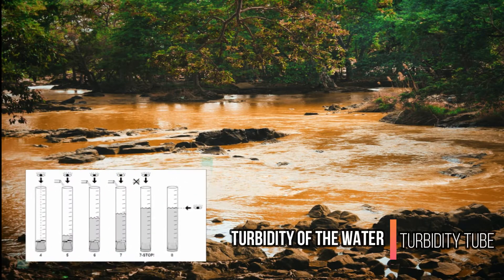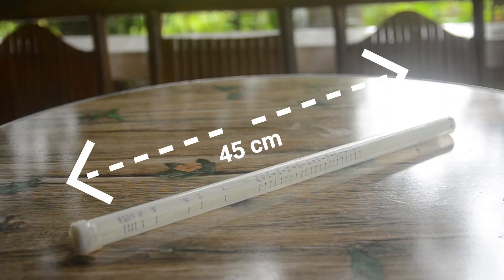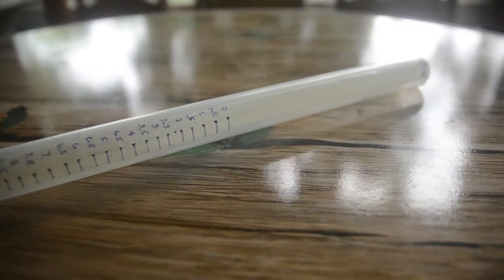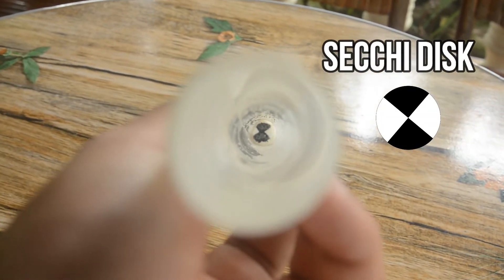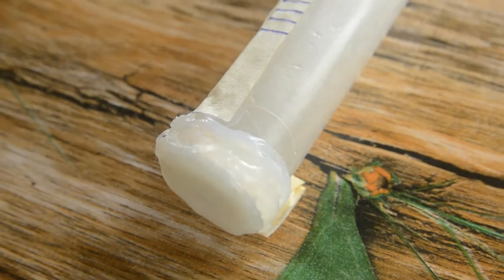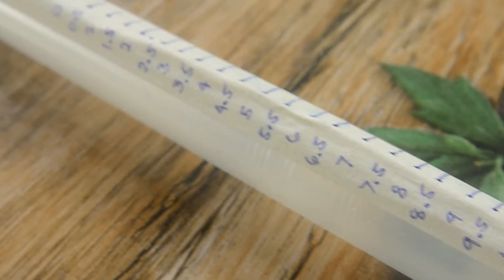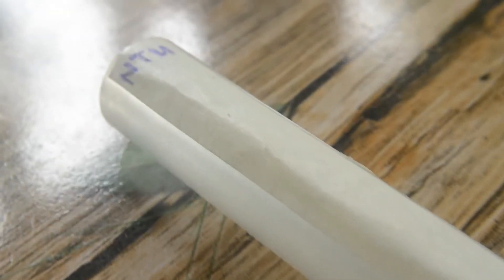This is a tool used to measure the turbidity or clarity of the water. My own design is 45 cm in length, 2.25 cm in diameter, and this transparent tube is made out of plastic. At the bottom part, there is a block mark. This is completely sealed so that no water can leak through. Here we have our measurement — this is the scale we use for reading the turbidity level, and this is the nephelometric unit, or NTU.